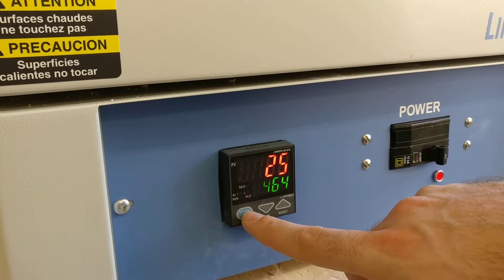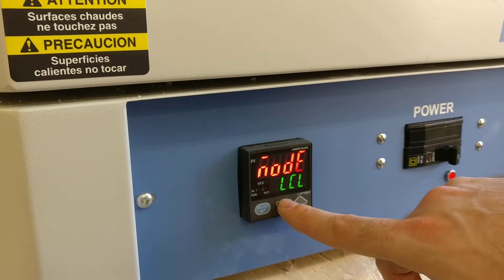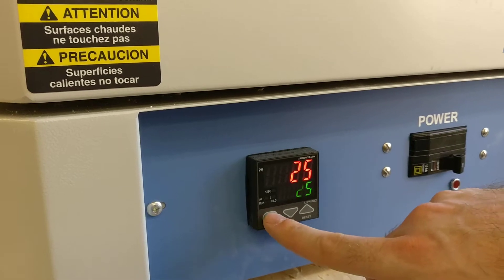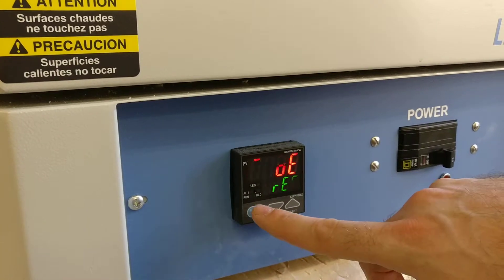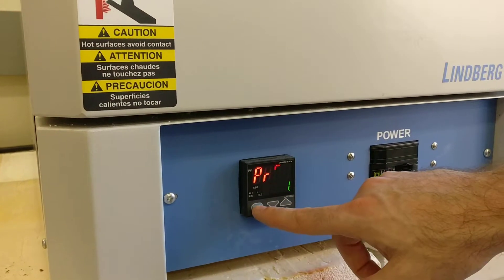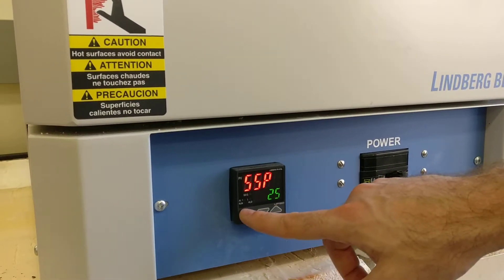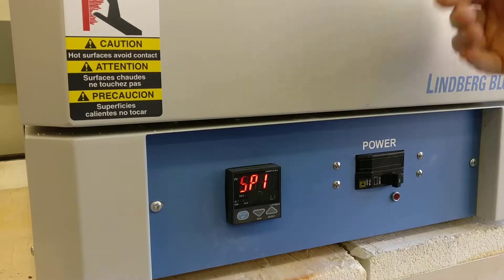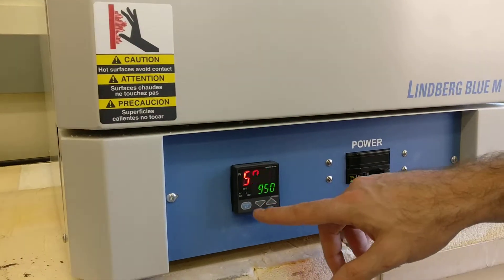If we don't want the local mode, we're going to hold this blue button again. Instead of local, we'll go to this RES. We'll hit the blue button again, go back into that, push it once. When you see this program go to one, this SSP is a starting set point that's always room temperature. Set point one — for us, when we fire these samples, that's 950 degrees Celsius.